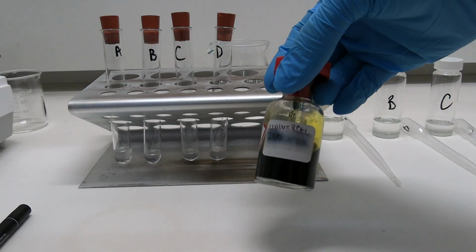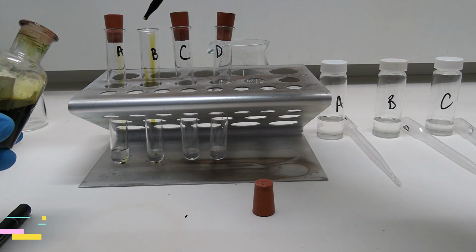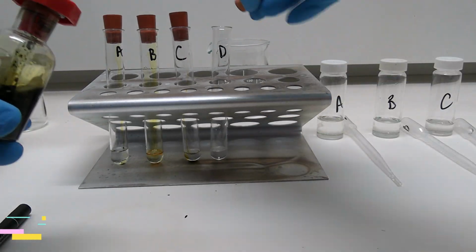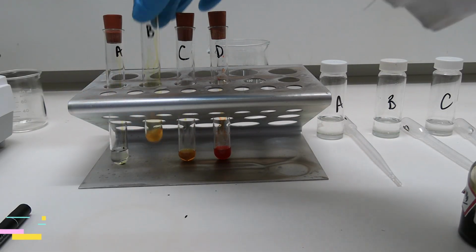We'll then add a couple drops of universal indicator solution to each test tube. Give it a shake and record the corresponding pH based on the colors you see.